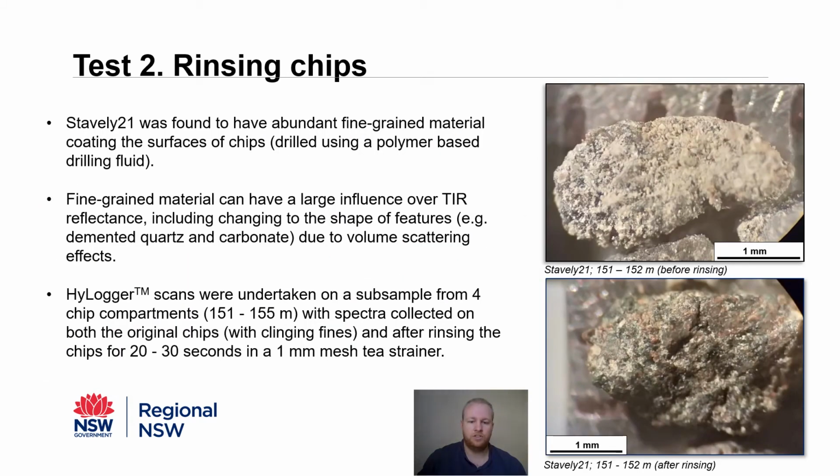Test 2 looked at chip preparation for HyLogging. A closer inspection of Stavely 21 chips found abundant fine-grained material coating the surfaces of chips, and is likely a combination of fines mixed with drying drilling fluids.